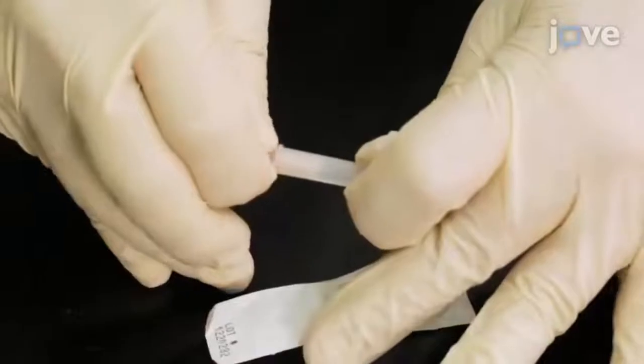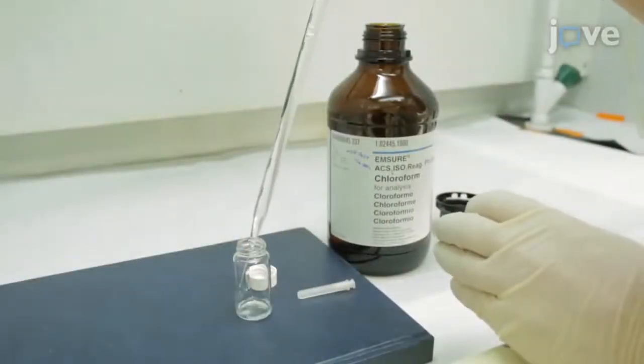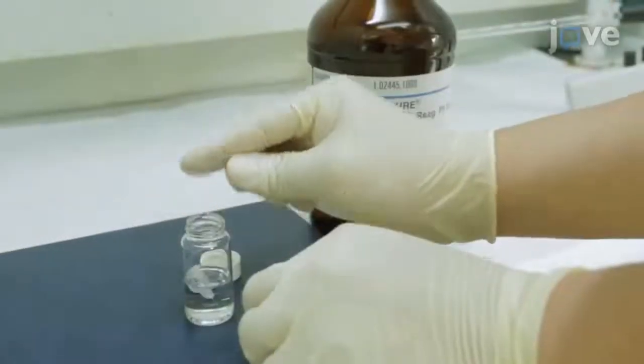Now, prepare 30 gauge stainless steel needles for the injection. First, pre-clean them by soaking them in chloroform for three days in a glass vial.